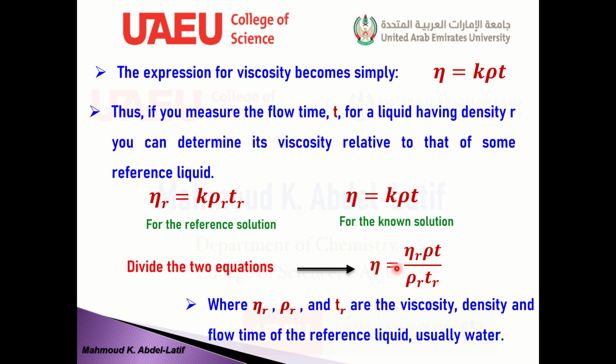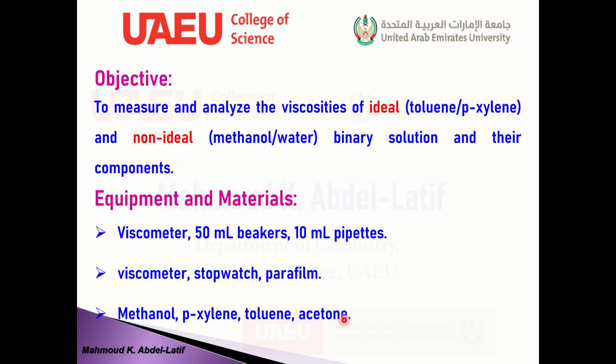Here eta r, rho r, and t r are the viscosity, density, and flow time of the reference liquid, and usually it will be water.